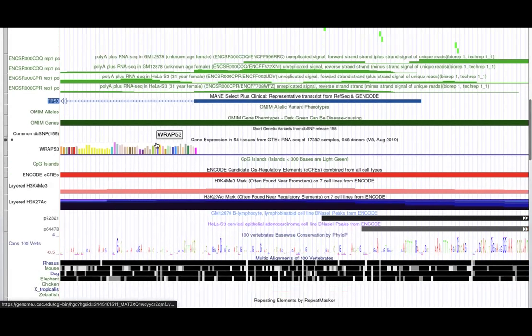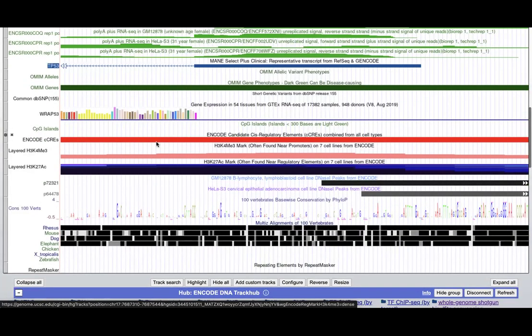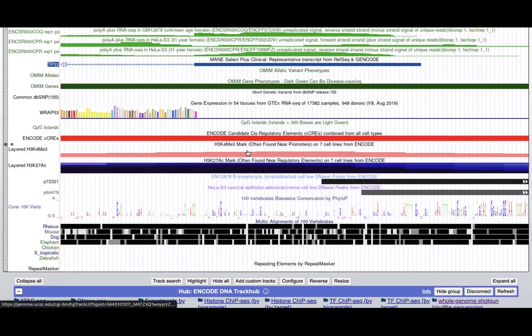And we should be able to see that one as well. All right, yeah, so that'll be right here. So you'll notice again that it kind of peaks up a bit, right where this first exon is in the transcription start site.